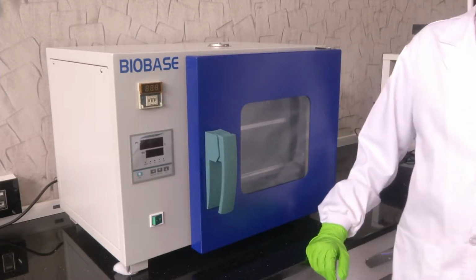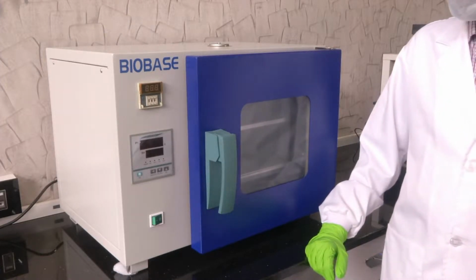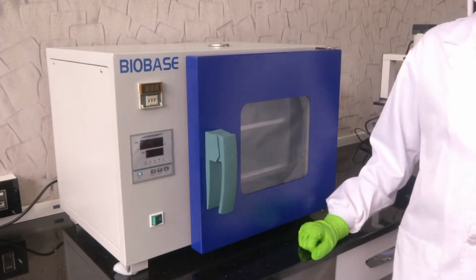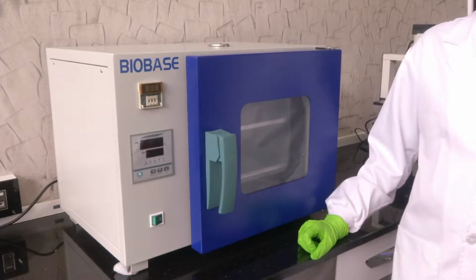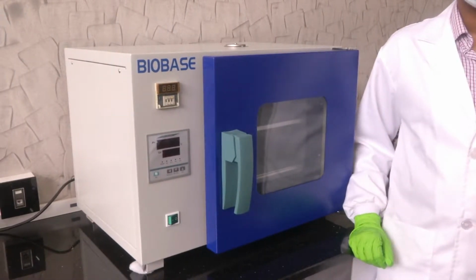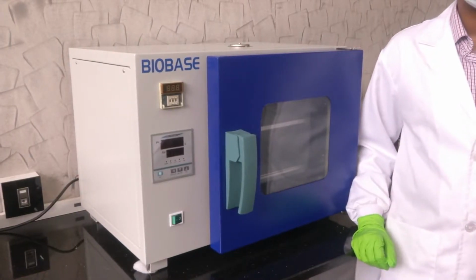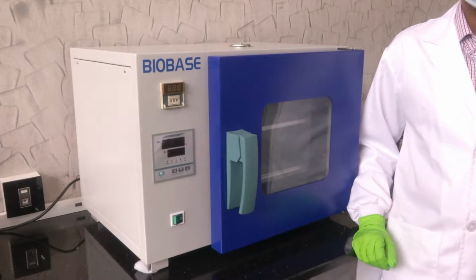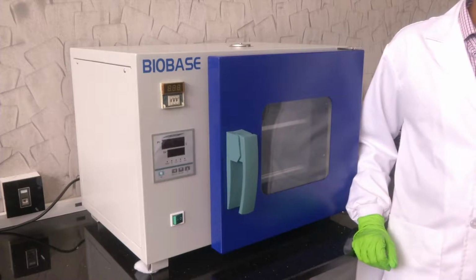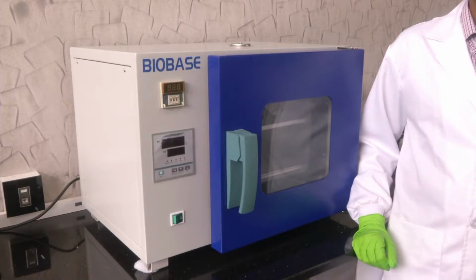This oven can go up to around 250 degrees Celsius. So, what are its applications? It can be used especially for microfabrication, for say PDMS molding. If you want to cure PDMS and make it hard, or if you have a process cycle where you have to heat your sample to a particular temperature, cool it down to another temperature, keep it there for a set amount of time and again take it to another temperature. So, if you have some thermal cycling profiles, you can use the oven for this.